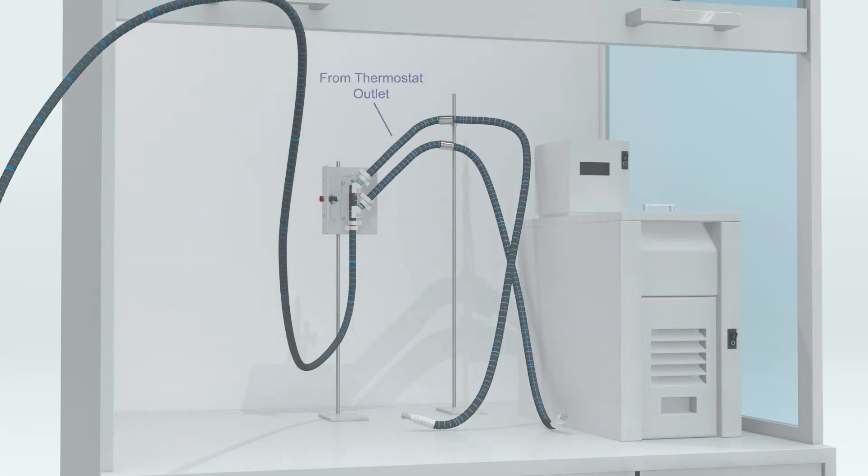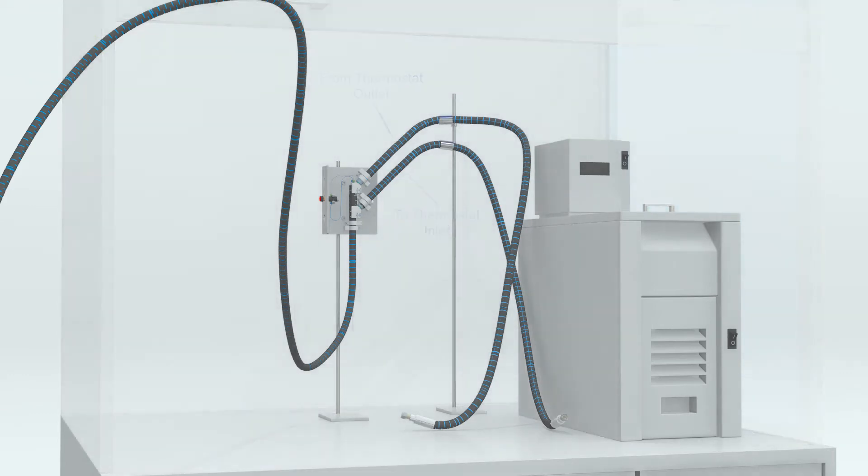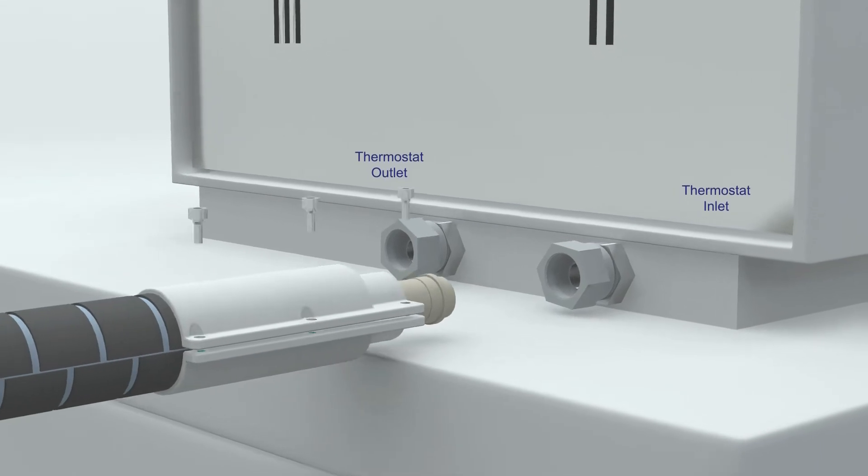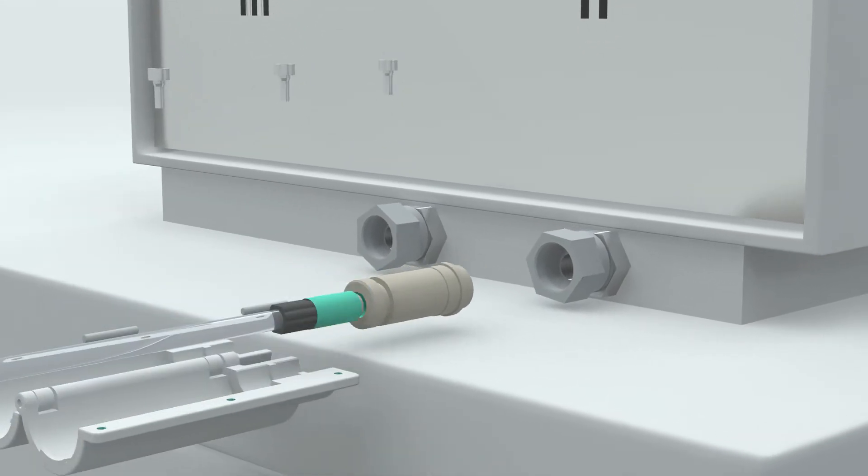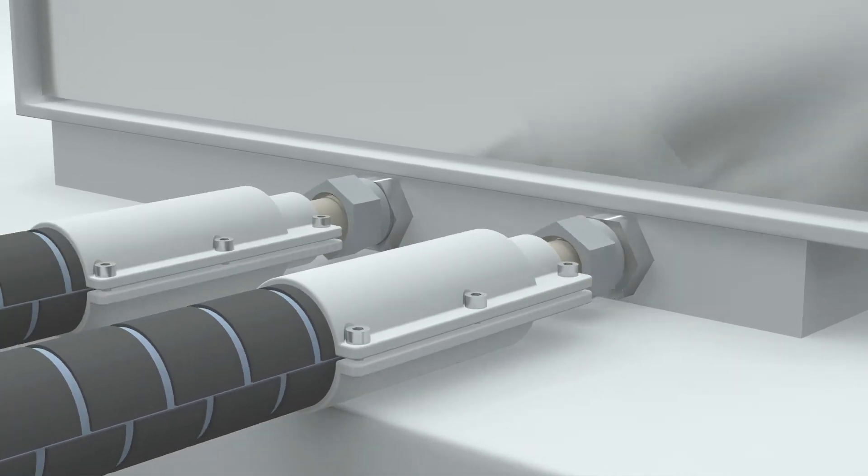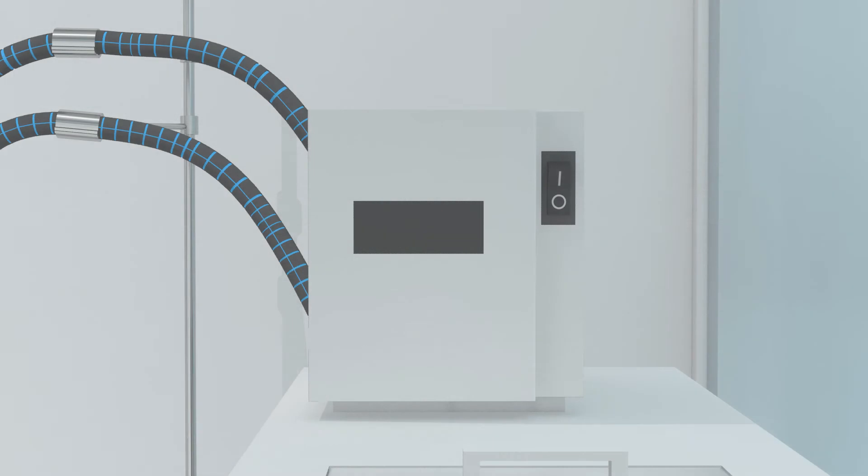Optionally, connect the thermostat to the inlet and outlet of the temperature control lines, shown here in detail at the rear of the thermostat unit, with the connections for both the inlet and outlet. Once this is done, switch the thermostat to ON and set the thermostat to the target temperature and wait until it is reached.